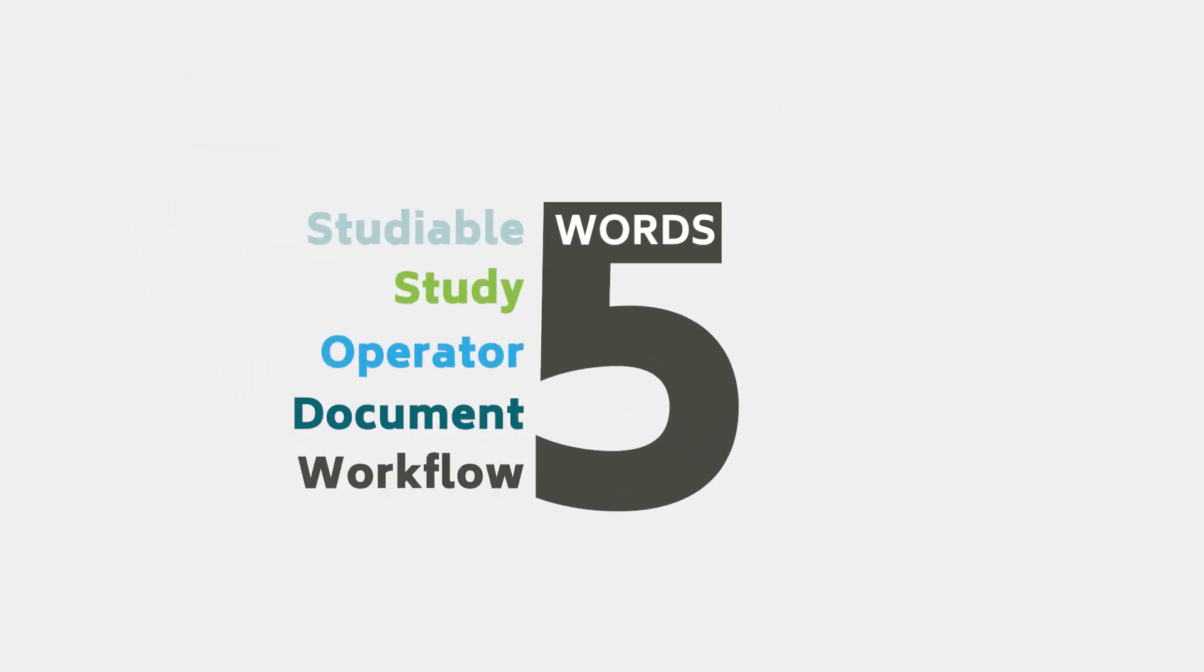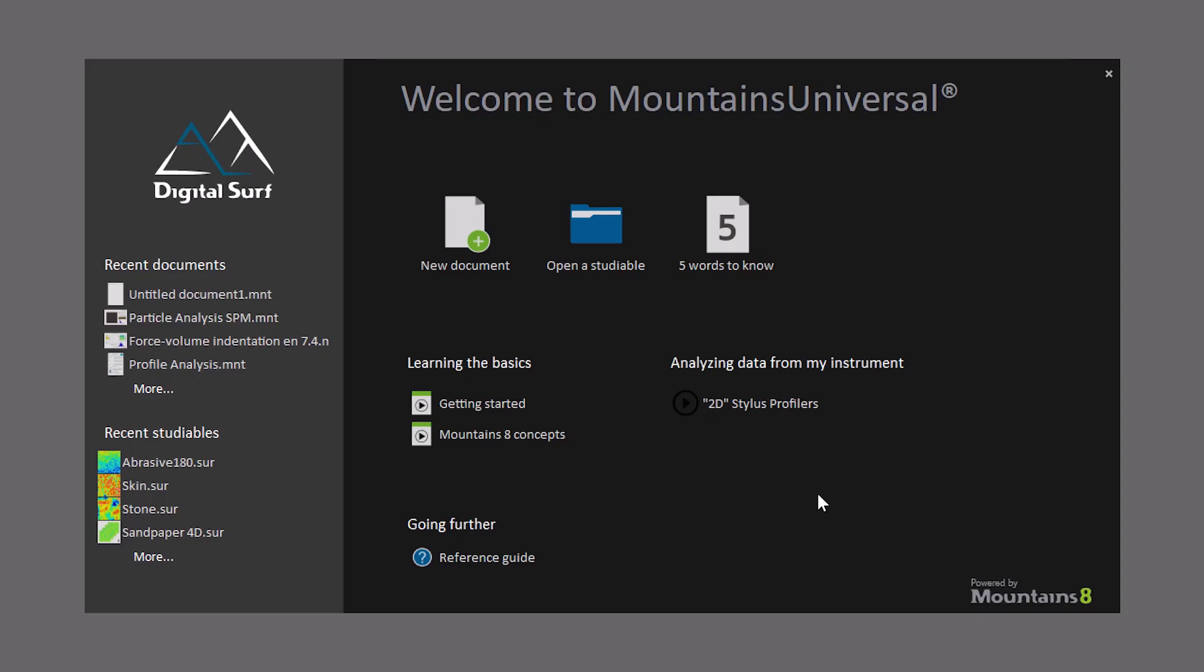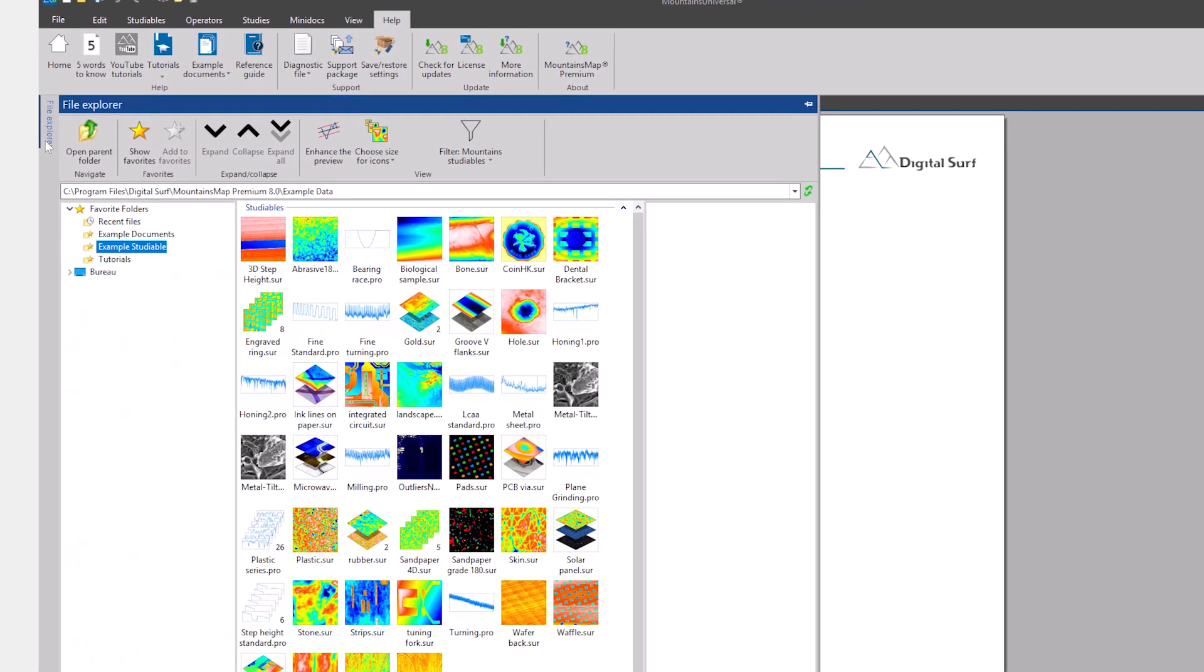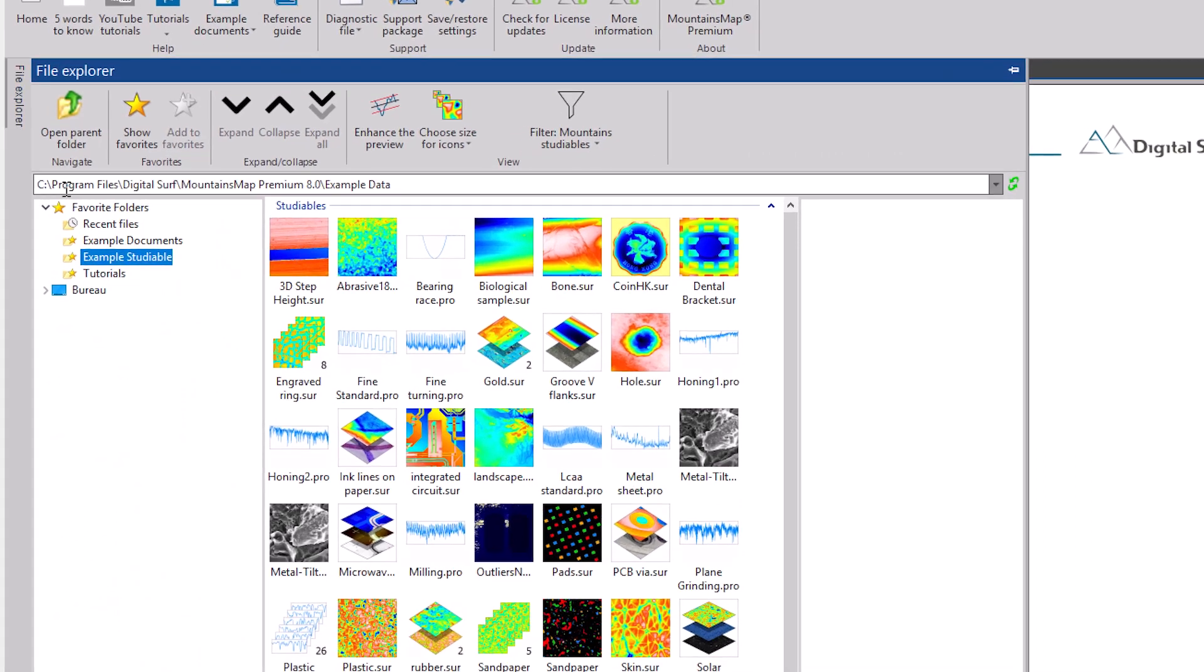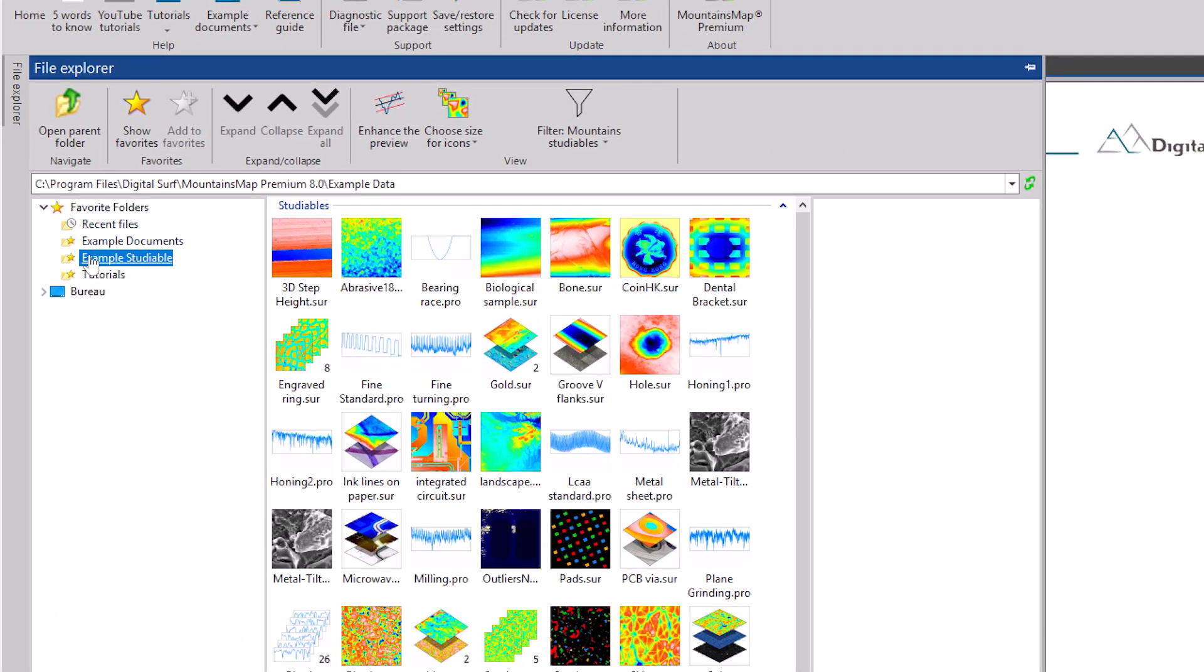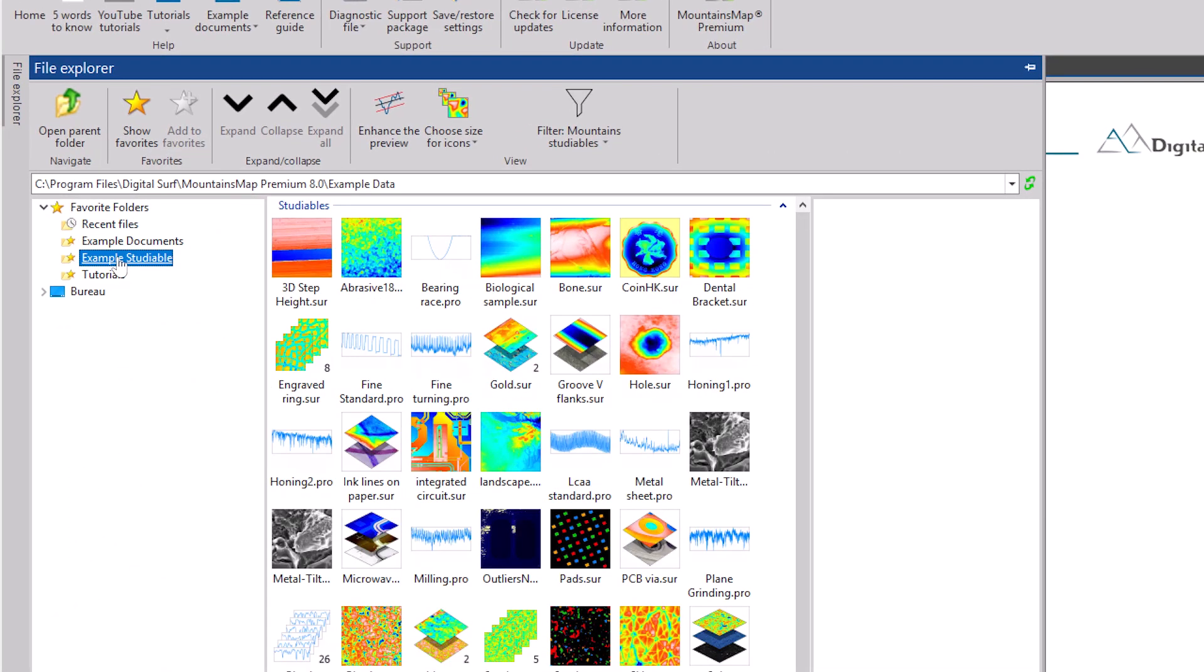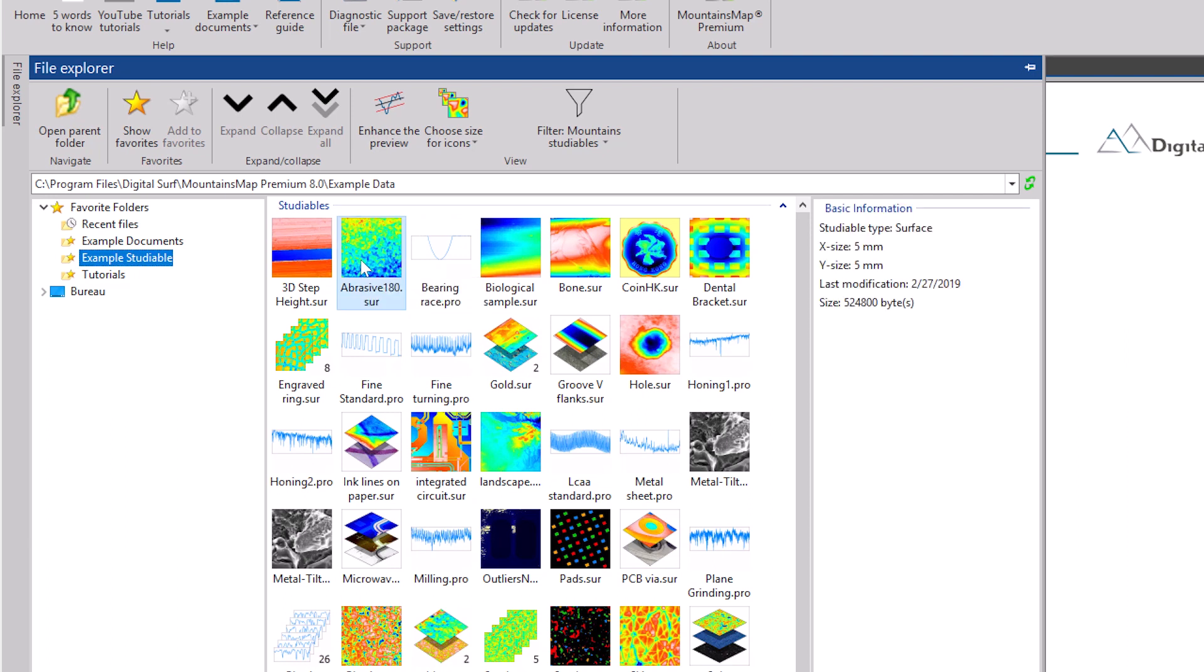Now that we've mastered the basics, let's open MOUNTAINS and create a new document. The file explorer can be accessed on the left and lets you browse to documents and studyables. To open a studyable, double click on it.